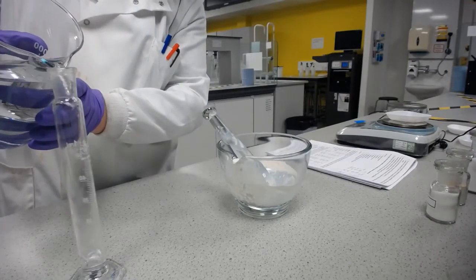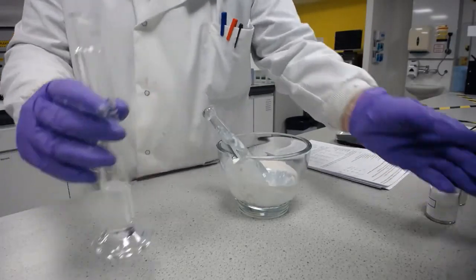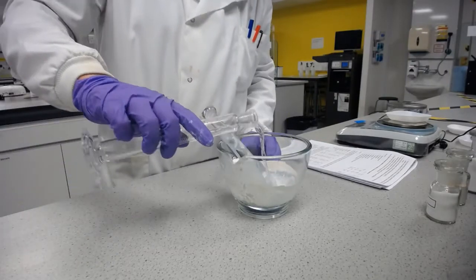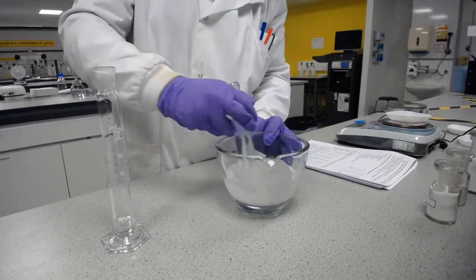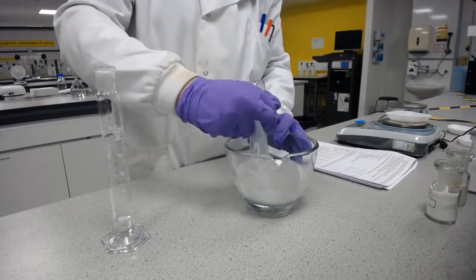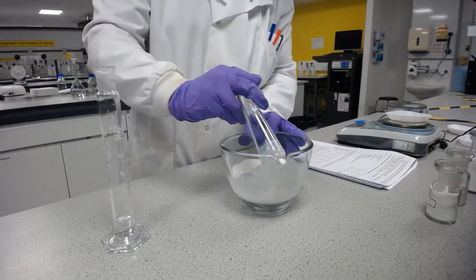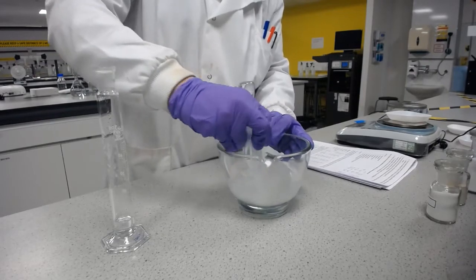So I know I've got 18 millilitres to play with, so I'll make sure that I don't put any more than 18 millilitres in here. And I can use that to just rinse out as much of the residue from here as I can, and get rid of any little lumps I maybe didn't get rid of before.